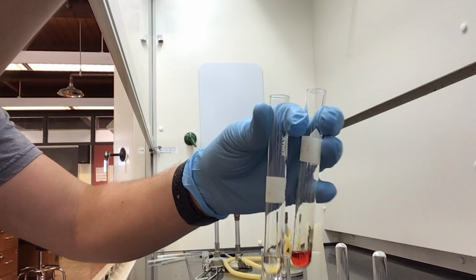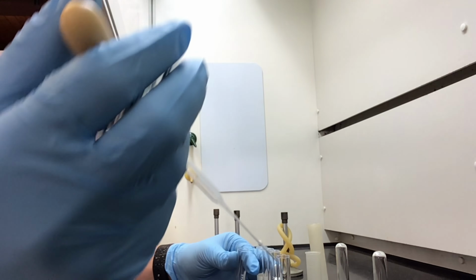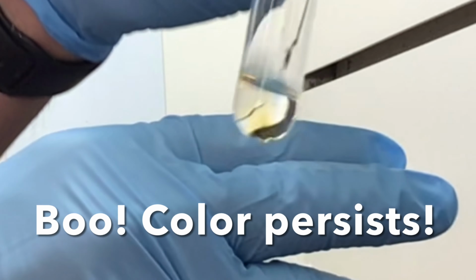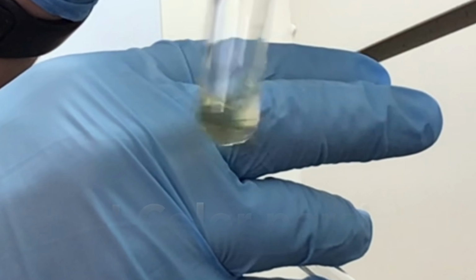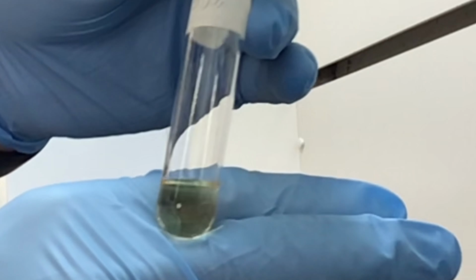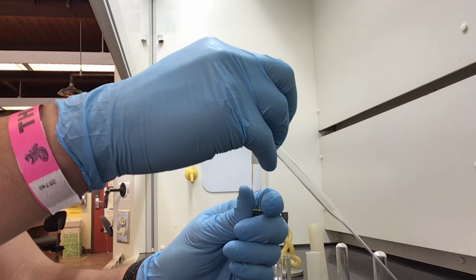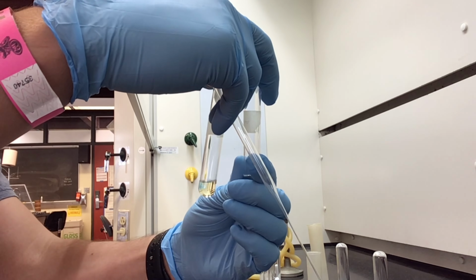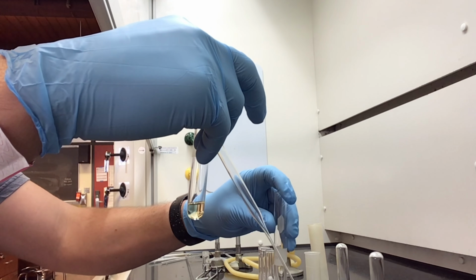So like I drew in the image, the OH on there, the phenol, that one will work. And what you'd get is the color not persisting like this color is. Again, you need that strong electron donor. By the time we perform this experiment, you will know exactly what I'm talking about. But for now, toluene, a benzene ring with just a methyl on there, doesn't react with bromine by itself.